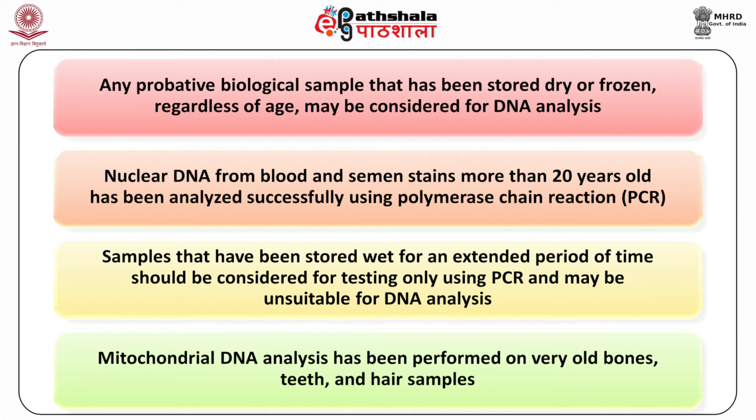Any probative biological sample that has been stored dry or frozen, regardless of age, may be considered for DNA analysis. Nuclear DNA from blood and semen stains more than 20 years old has been analyzed successfully using polymerase chain reaction.